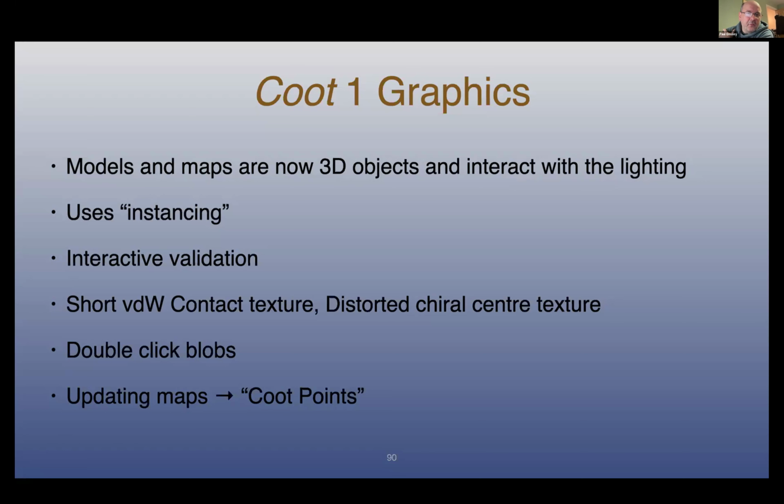And there's a thing at the bottom here, credit to Tristan, who first showed this to me and others, updating maps and how useful they were. And I implemented that with the help of Kevin, as he was at the time, Catherine now, Cowtan, and yeah, that was very helpful.